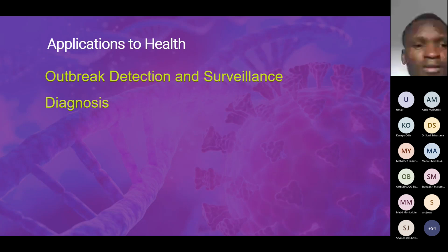By the time you do metagenomics, you'll be doing some in silico analysis, using machine learning to discover specific phenotypic features that probably contribute to the resistance, the intermediate, or the susceptibility of the specific microorganism present in the metagenomic sample. So with a metagenomic sample, you can actually trace down your source to a specific issue associated with the problem you're trying to solve.